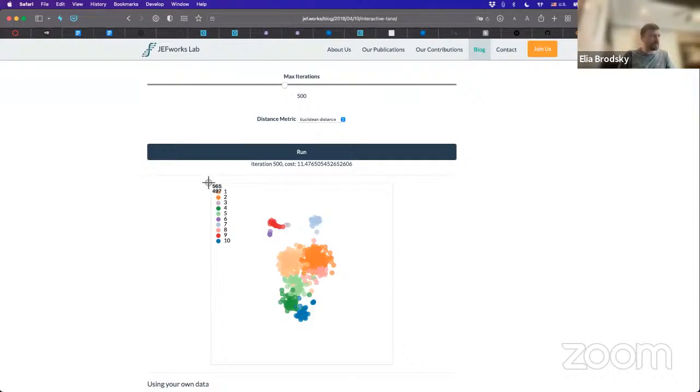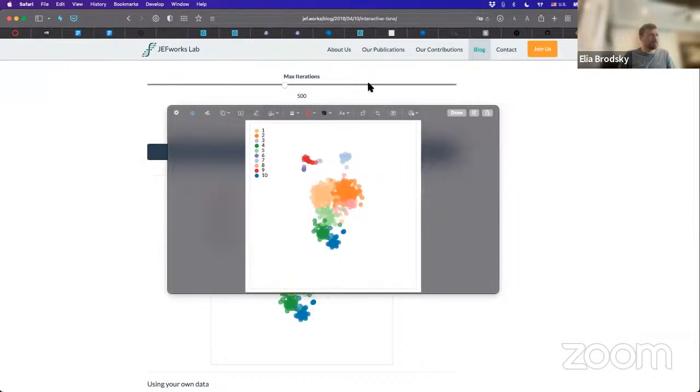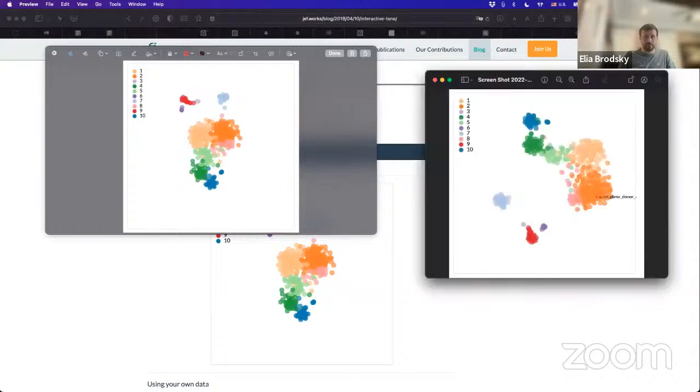Okay, why do we think it is worse? What gives you the impression that this is worse? Julia. Harder to distinguish clusters. Okay, so Julia is saying that visually I can see the distance between the clusters. It's greater over here, and it's less over here. This is more kind of together. And that is why I am saying that this is a worse choice, and this is a better choice.